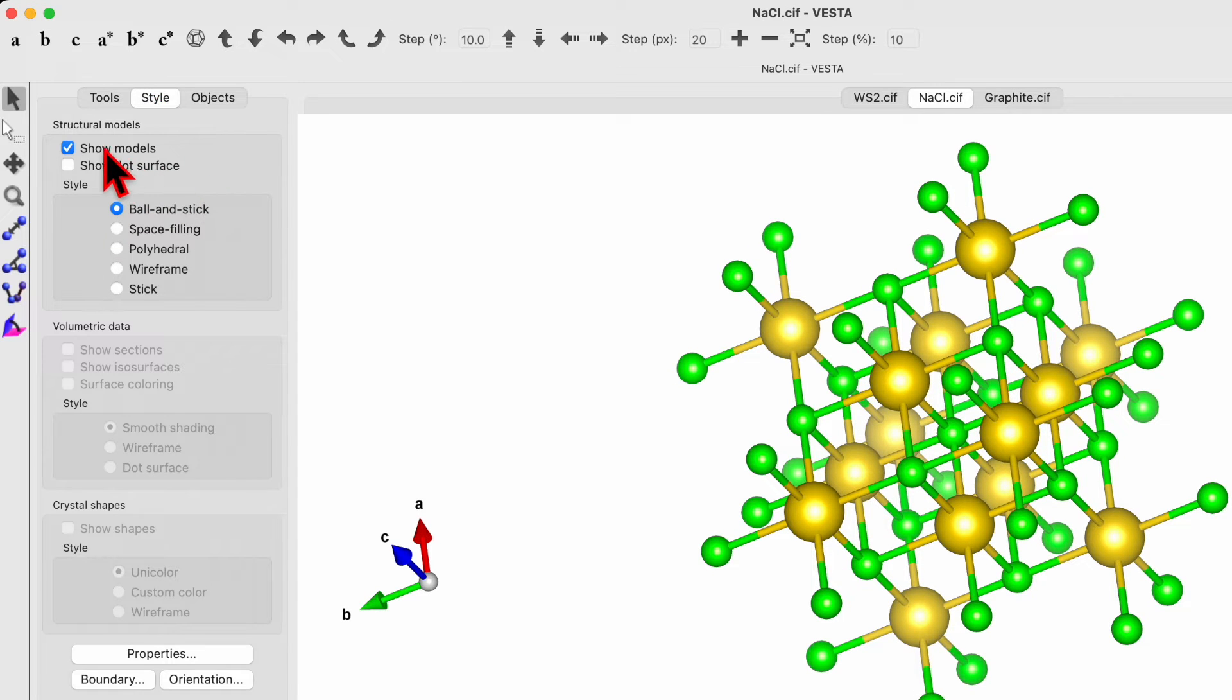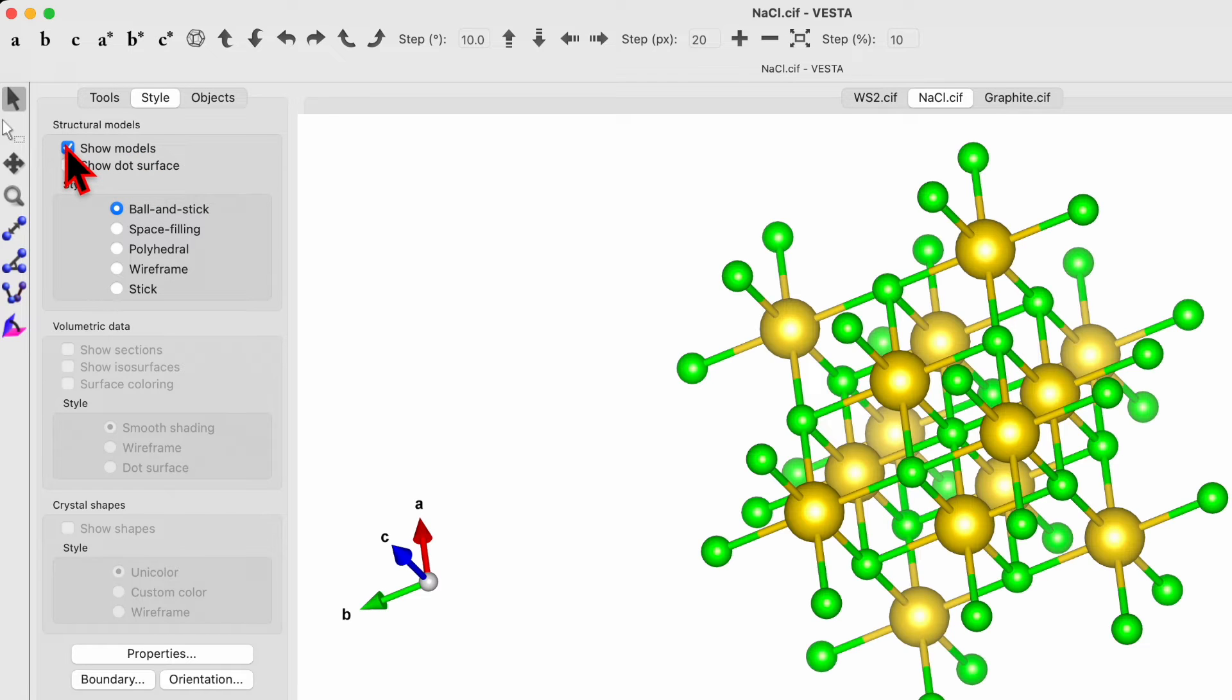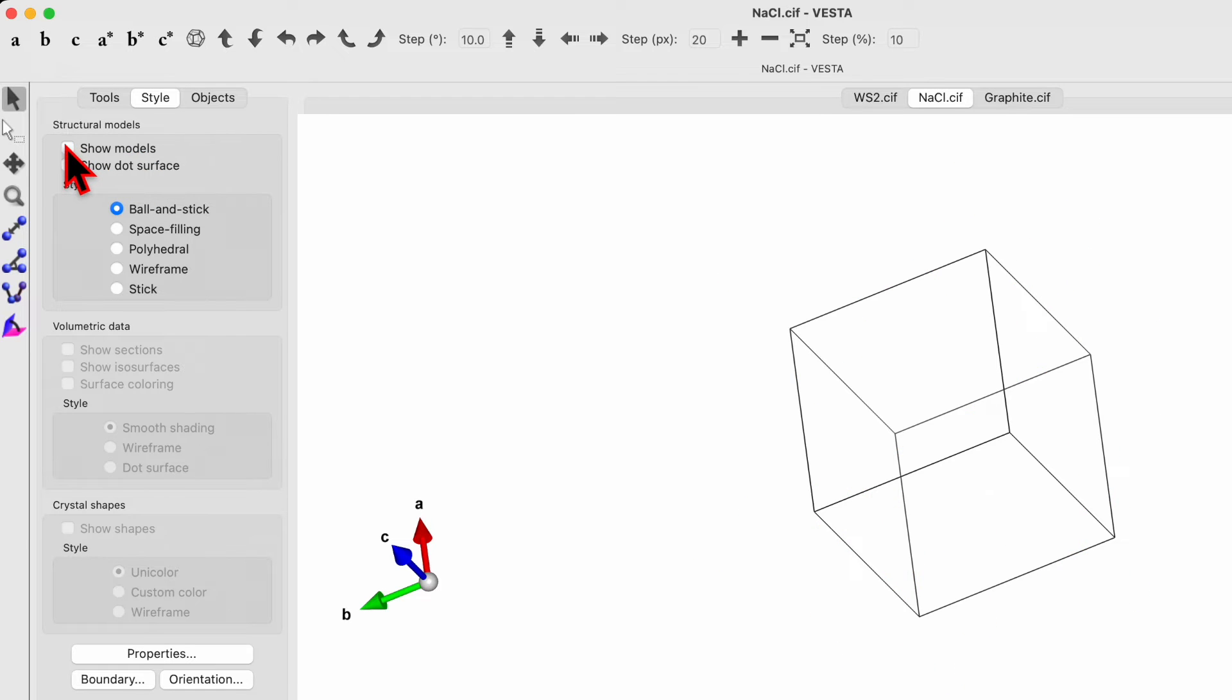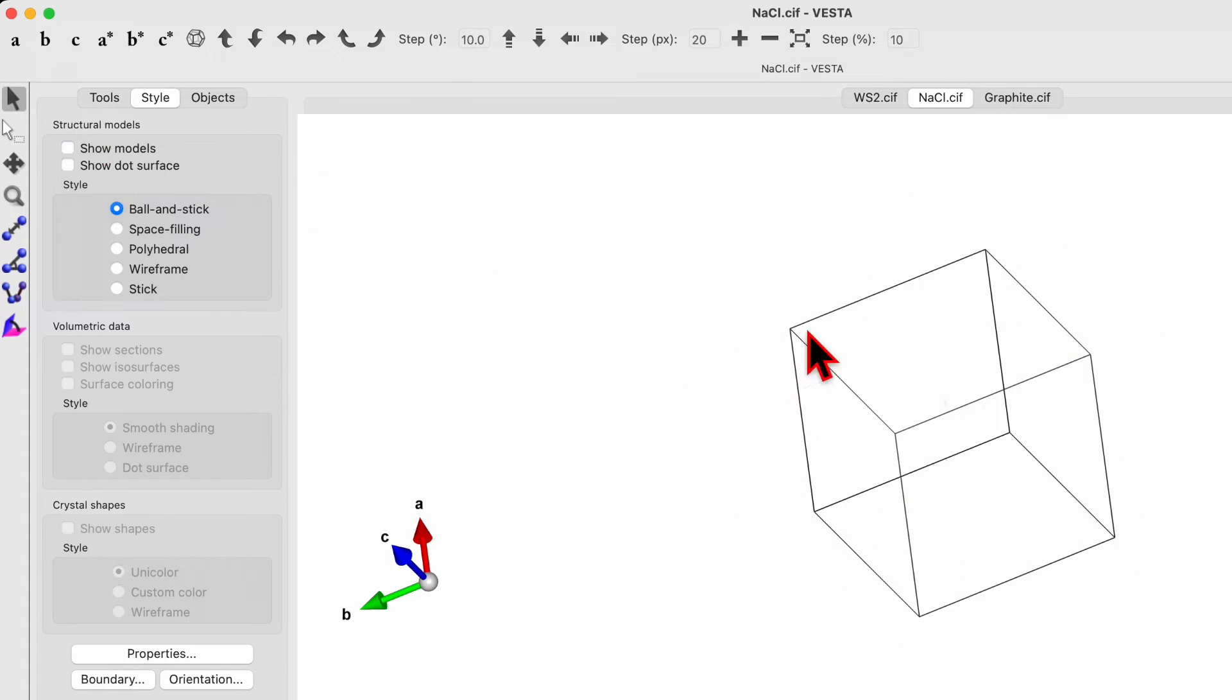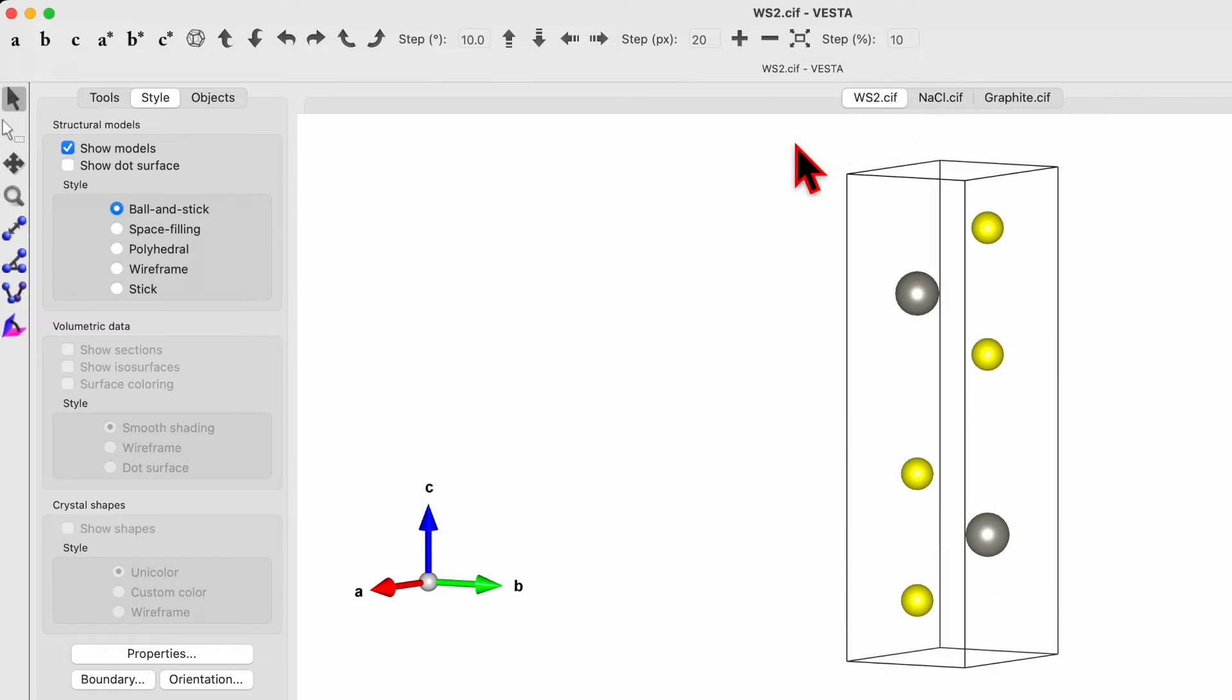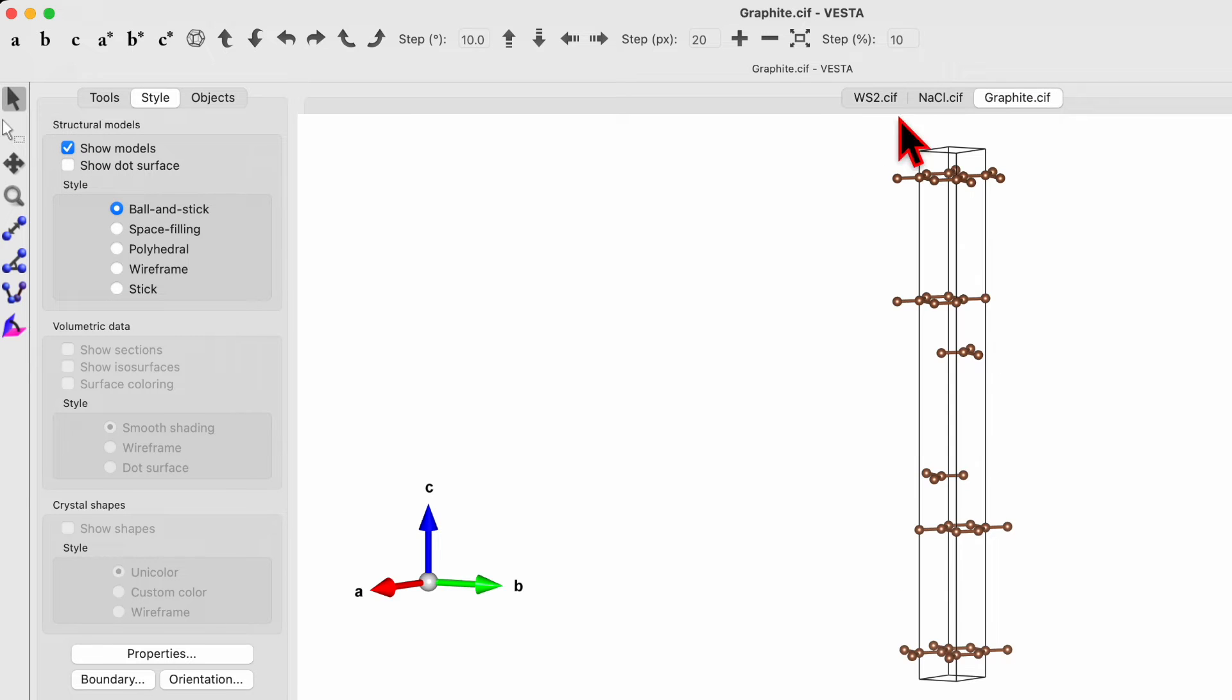Then the style. Here you will see the show model style. If you uncheck, the model will disappear. Only what you see is the edge of a unit cell. And since this is a face centered cubic, you see the edge for face centered cubic. If you go to the WS2, this is hexagonal structure. Similarly for graphite, hexagonal structure.